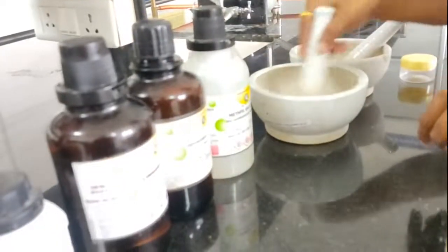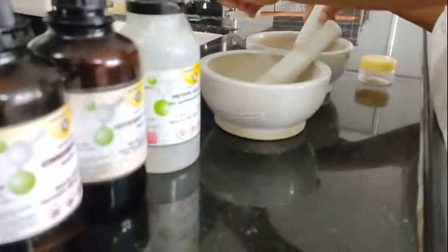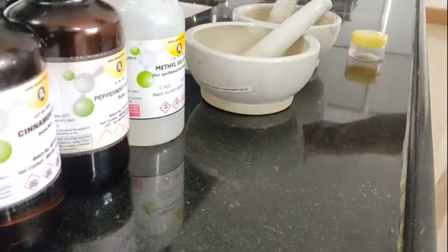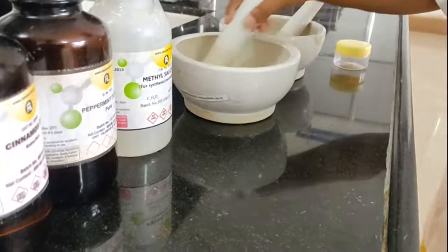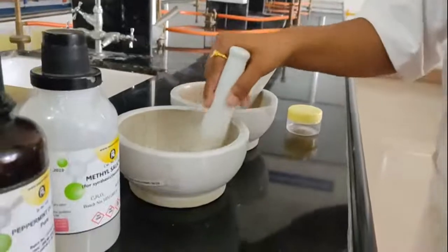Then I will properly mix all these added ingredients in the mortar, and after that the last addition of the hard soap is done into both the mortars, and after that we will again properly triturate all the ingredients in both the mortars.